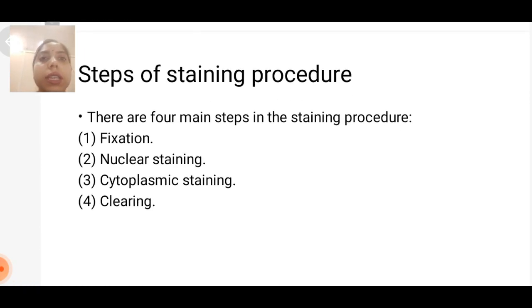Then there are the steps of the staining procedure. We have 4 steps for the staining procedure. First one, fixation, then nuclear staining, then cytoplasmic staining, and then clearing.